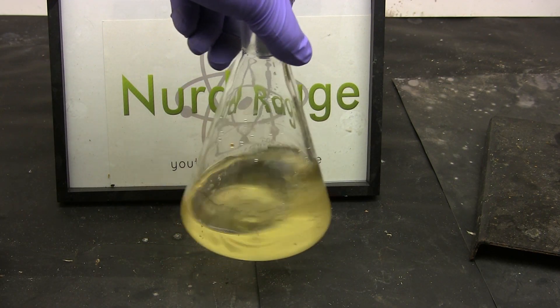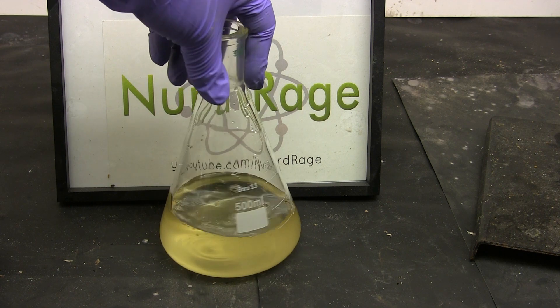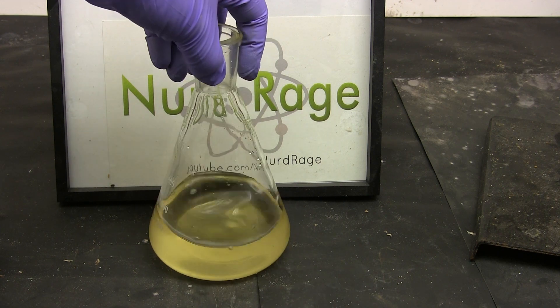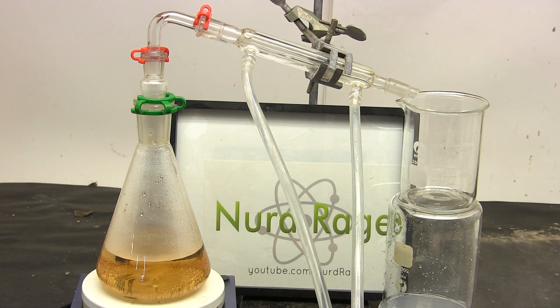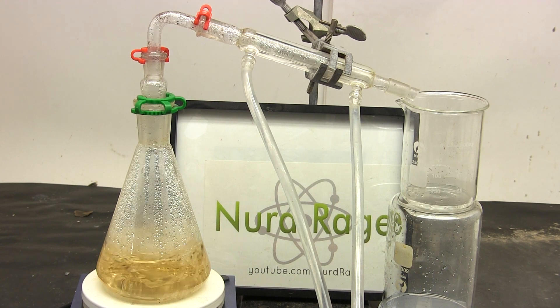There's still a lot of sodium sulfate dissolved, so to further purify it we're going to distill it. Set up a distillation apparatus as shown, then turn on the cooling, the stirring, and the heating, and distill off the hydrobromic acid.